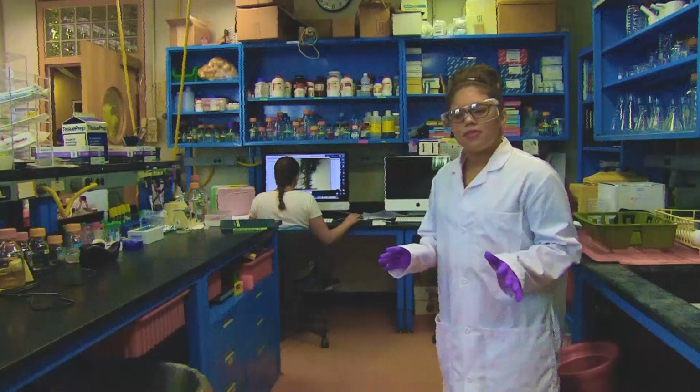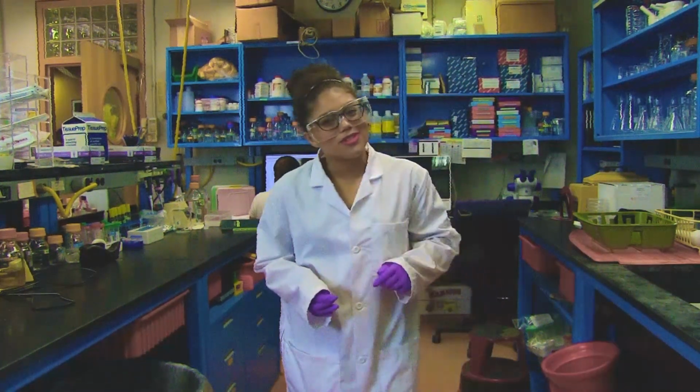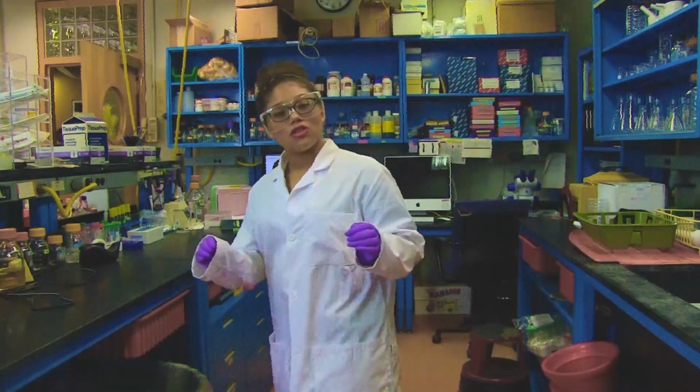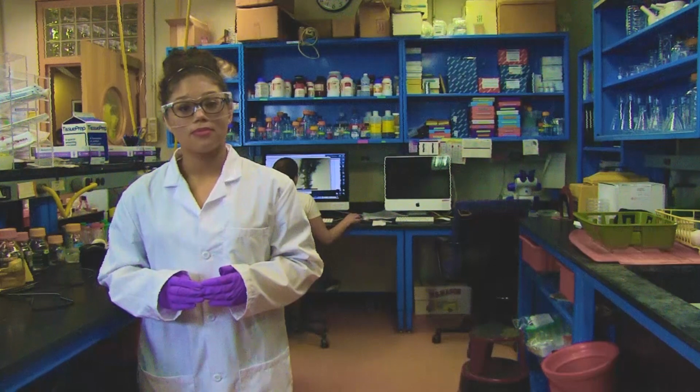When working in the lab, things can be a little dangerous. In fact, you could even say that things can ramp up pretty quickly. As you might have guessed by the title of this video, Wellesley College employs the RAMP method to reliably reduce the risks of working in the lab.